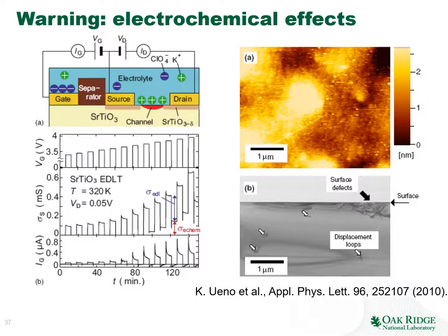However, you start to notice that almost from the very beginning, there is a relaxation component to this behavior. Once your gate bias becomes comparable to 3.5 volts and higher, you can see that the time relaxation becomes extremely pronounced. More importantly, the system does not return to the ungated state. So this gating effect becomes irreversible.